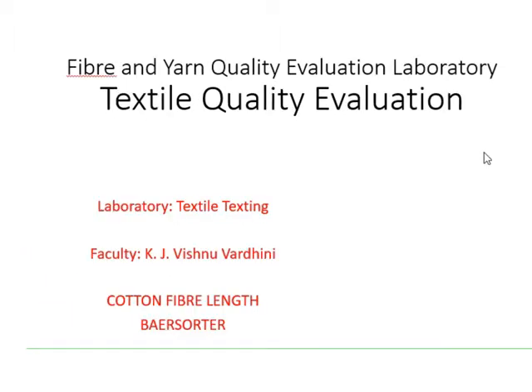This lecture is a part of textile quality evaluation and also a part of fiber and yarn quality evaluation laboratory. Myself, Vishnuvardhani. Today we are going to see cotton fiber length determination using the instrument Baersorter.